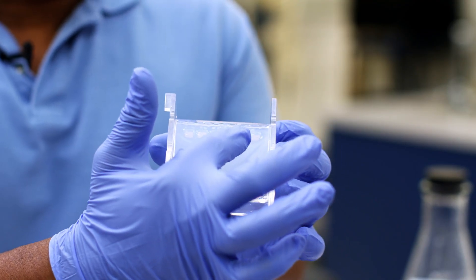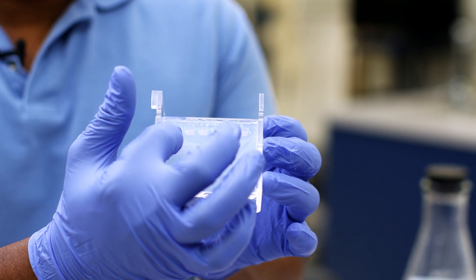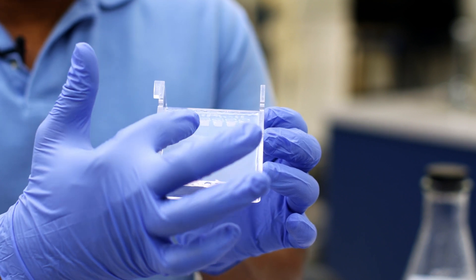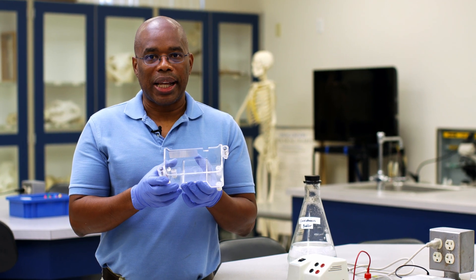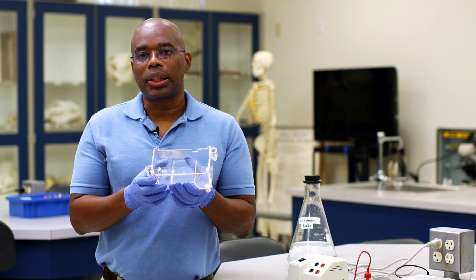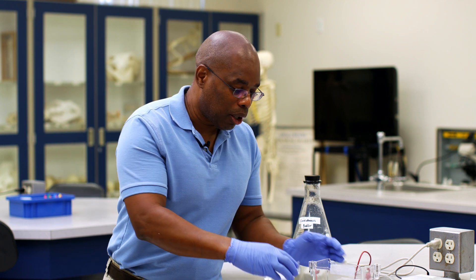Here you can see the holes or wells — this is where we're going to load our samples. As we run the samples, they're going to migrate through the gel and separate as they move. Our next step is to put our gel in this acrylic-based apparatus called the electrophoresis apparatus, which is what we use to expose an electric current to our sample so that we can get our samples to move through the gel. We want to line up our gel in a very specific orientation.